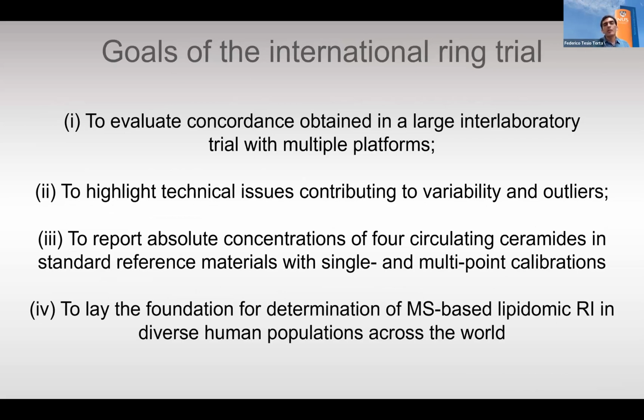Now, the major aims of this study included evaluating the concordance between labs and platforms, to highlight the technical issues that could contribute to variability and the outliers, to report absolute concentrations of the 4 circulating ceramides in all the 4 standard reference materials with both single and multi-point calibrations, and hopefully also to lay some foundations for future measurements and future determination of lipidomic reference intervals for, in this case, ceramides in diverse human populations.